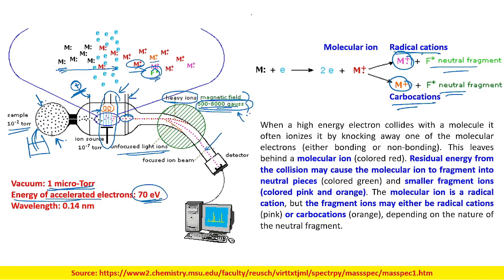As per the de Broglie matter wave equation, we have lambda equals h by mv. So we can write it as h by p. Now the energy is given by p square divided by 2 m e.